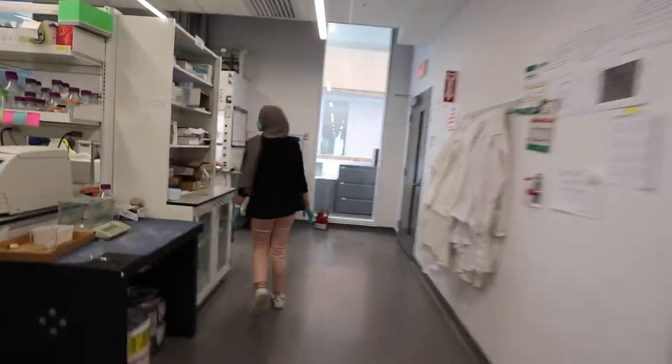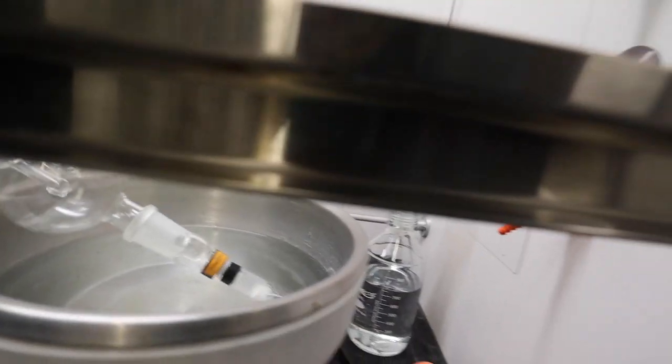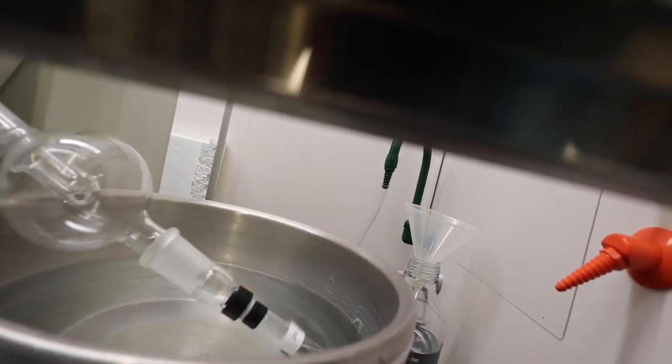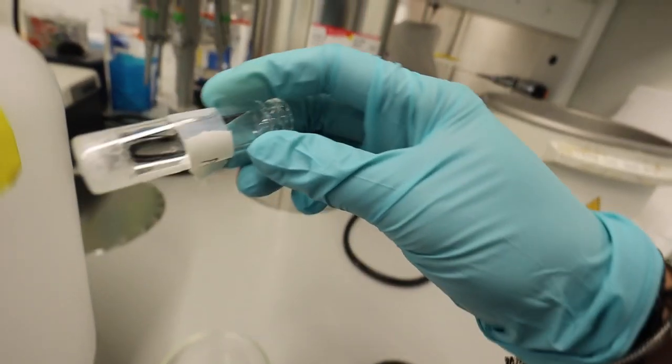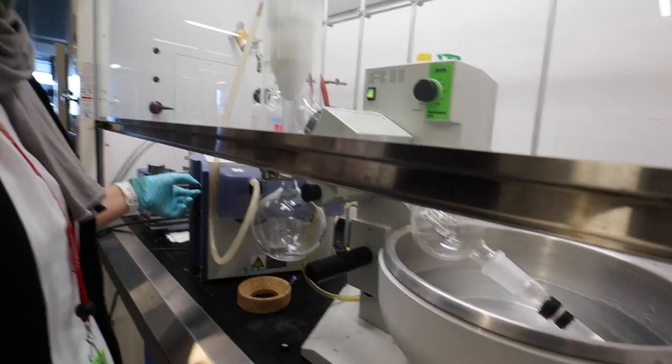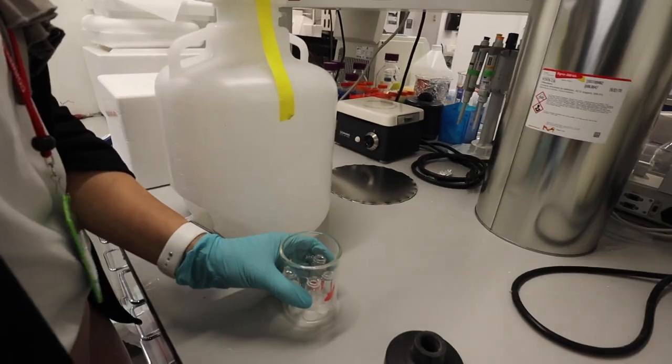Oh yeah, the tap. I never did that. I never did the tap tap and the twirl twirl. That's why it's gonna have the pressure. So you're gonna do this ten times? Yes. I caught it! Done. While it's cleaning, we're gonna check the thin film. This is how Noju operates - just three bazillion things at a time. This is the second thin film, the first thin film is already done. What? It failed. It doesn't look like a thin film. It's fine, it still works right? She said it's not supposed to be clunky like this but it's fine. It's the pump's fault, not Noju's fault. Alright, that's the last one. So now we're going to put all of this on the high vacuum pump to dry some more.